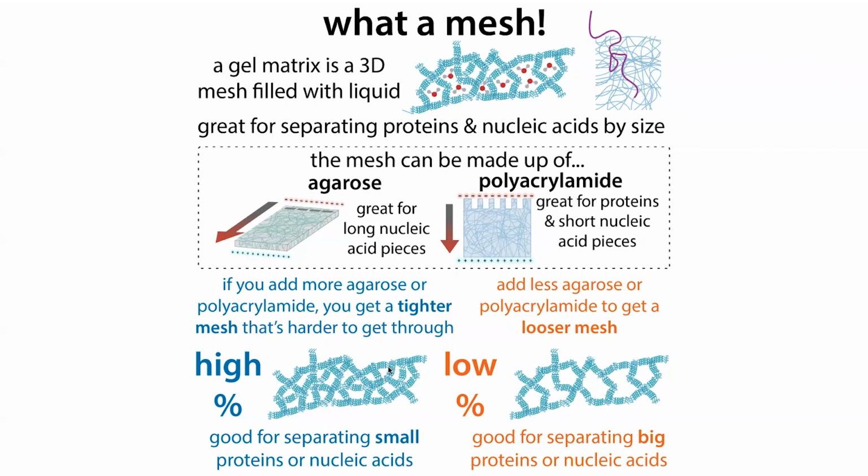And so if you want to separate small things, you're going to want to use a higher percentage. But if you have bigger things that you want to separate, now the low percentage is going to do a good job, whereas with the high percentage, they're all going to be way bigger than those pores, so they might not travel very far if they can even get into the gel itself.